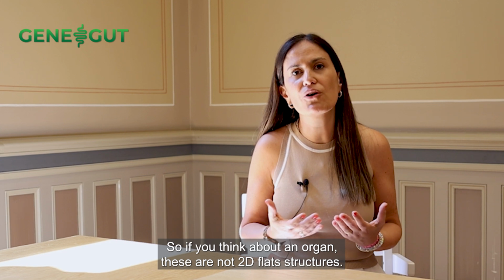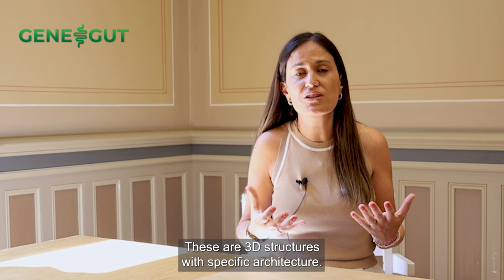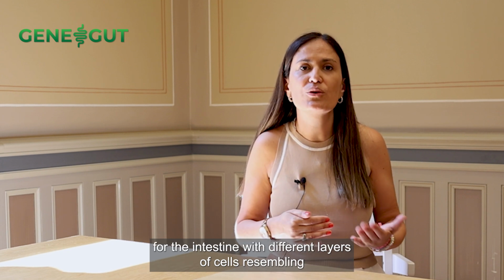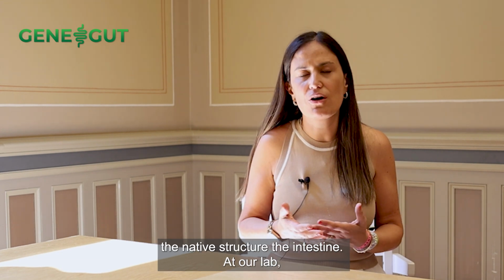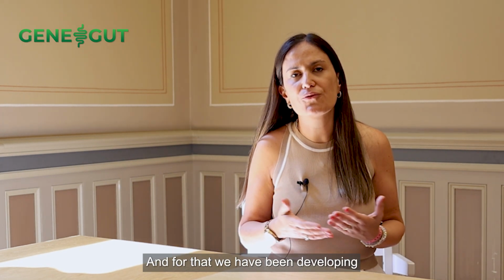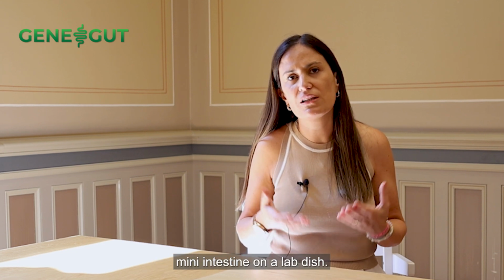If you think about an organ, these are not 2D flat structures. These are 3D structures with specific architecture. So in our lab, we have been reassembling this type of structure, in particular for the intestine, with different layers of cells, resembling the native structure of the intestine. At our lab, we want to mimic the intestine to study Crohn's disease, and for that, we have been developing a mini-intestine on a lab dish.